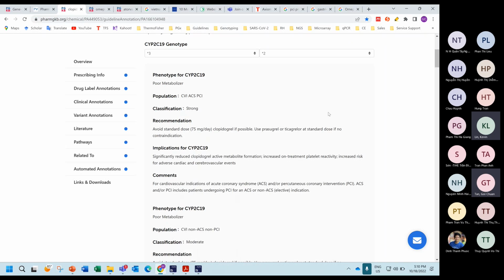It will be fun next time you do your own genobank. If you have the extraction machine, next time your customer sends you like 50 samples, then you still have empty space, right? Then you just do your own extraction, and then you do this analysis. Then you will feel it's very fun because you understand yourself more.